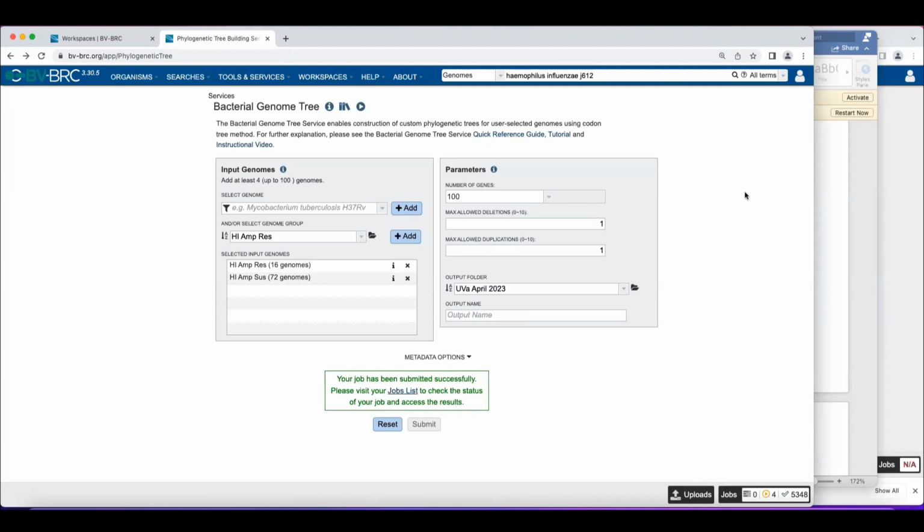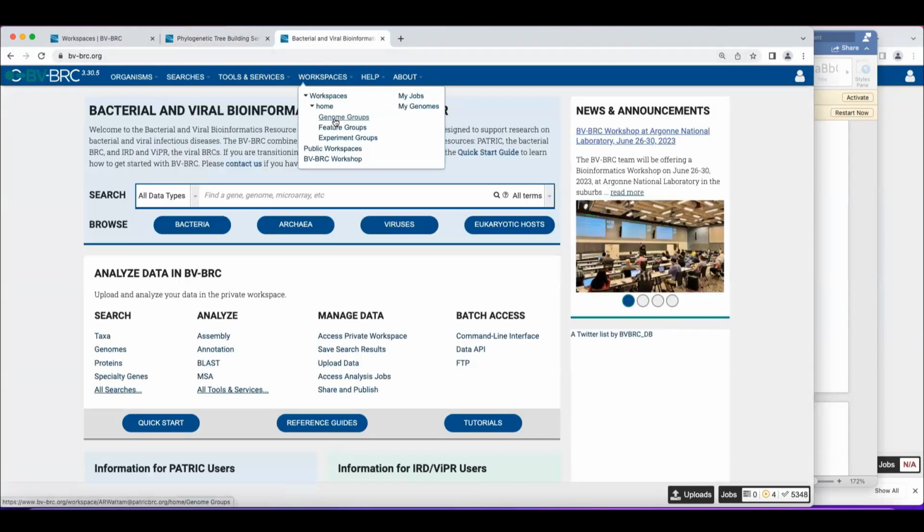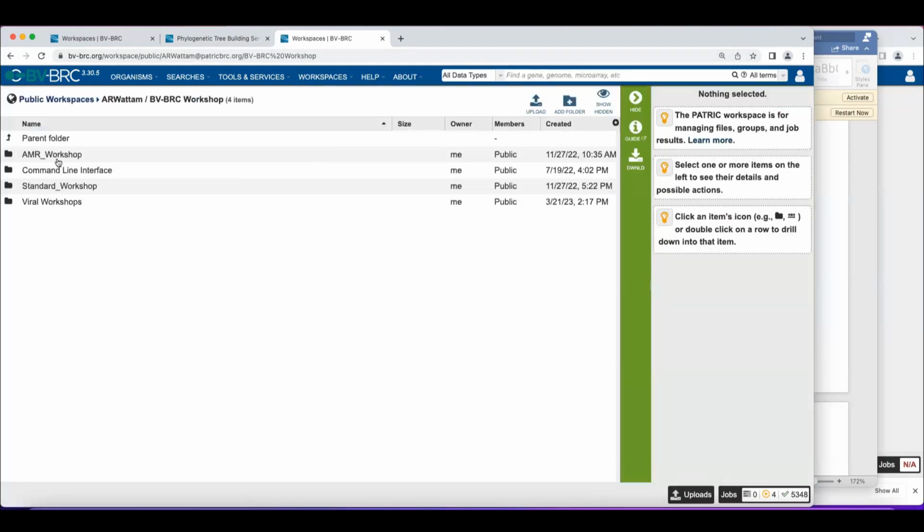Now there's 4 jobs running. And I don't know, Rebecca, if we go to that folder, we'll... Needed jobs.